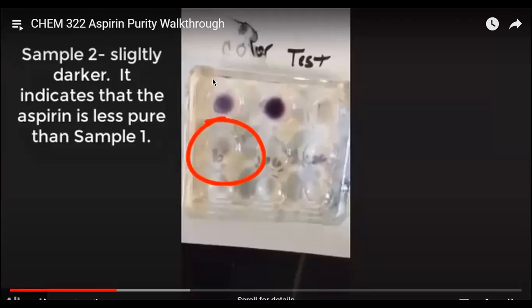Or if it's within limits when you do other analytical techniques, because you're not just doing an iron chloride test at an aspirin factory, right? Because it's not accurate. It's qualitative. But if you quantitatively test it and you see that it is less than or equal to the accepted limit, which is 0.15%, then you don't have to do anything.